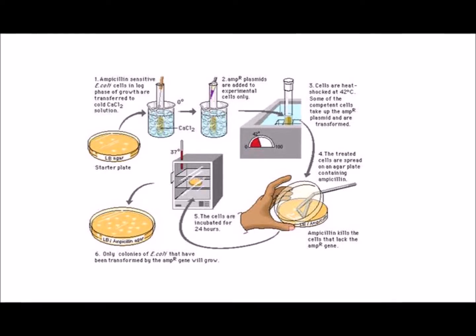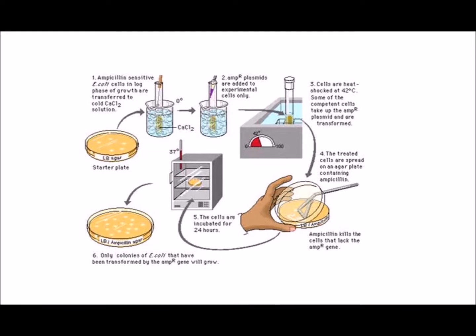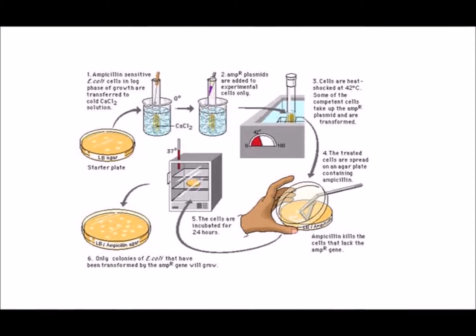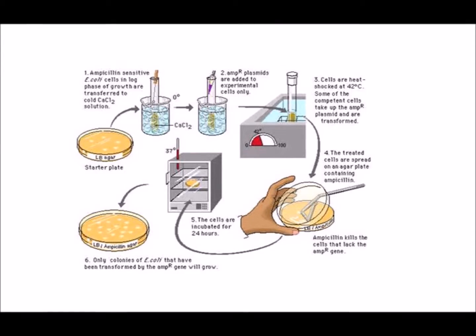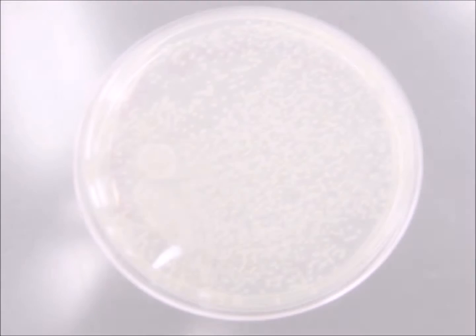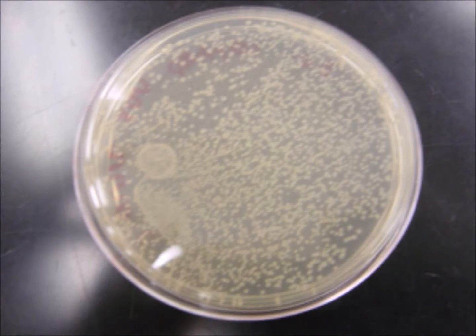The cations of the solution interact with the negative charges of the lipidic membrane to create pores, allowing the DNA to go inside the cell through a hydrophilic channel. This is helped with a heat shock, time during which the DNA enters completely into the cell. Electroporation has higher transformation efficiencies and it's easier to manage, but it's more expensive and salt sensitive.